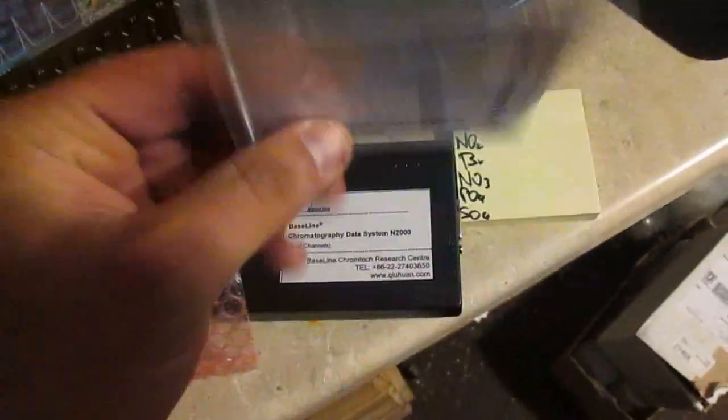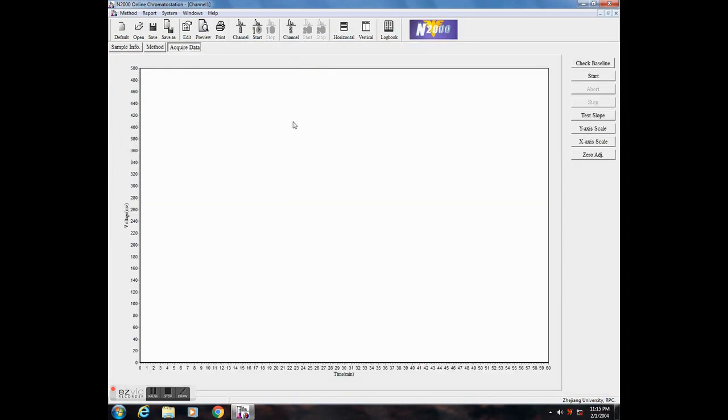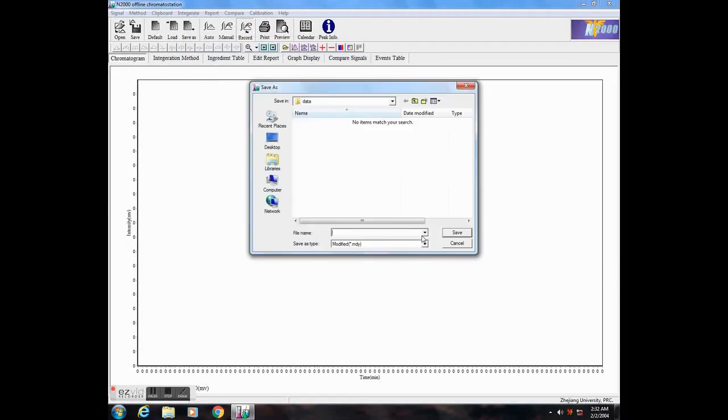For about a hundred bucks you get the interface, the software which allows for data acquisition, calibration, customizable analytical reports, and more — along with all the cables necessary for data acquisition and processing. I've got two of them and my next project will make use of the second one.